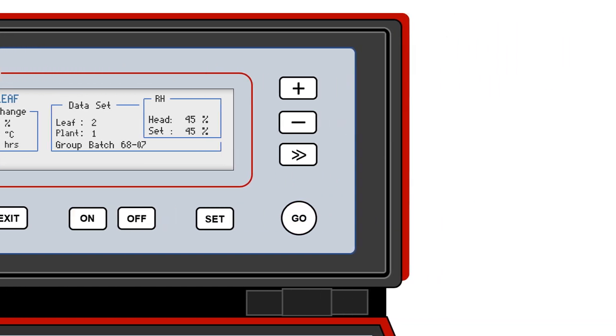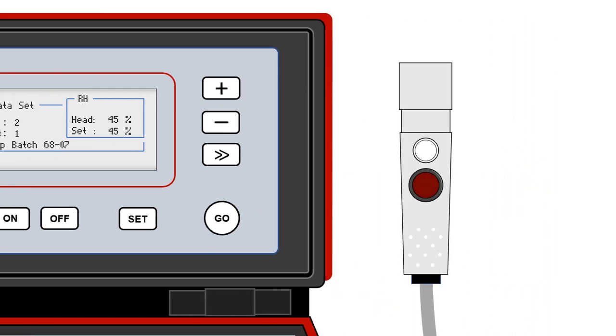The control button on the sensor head performs the same function as the Go button on the AP4 body, enabling fast, one-handed control of the measurement process.